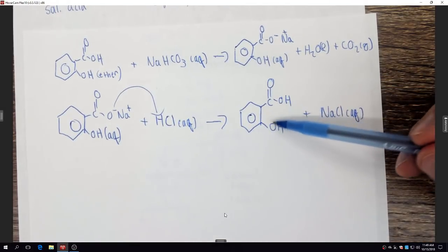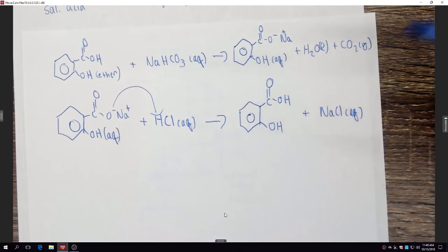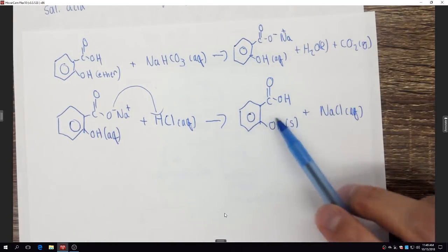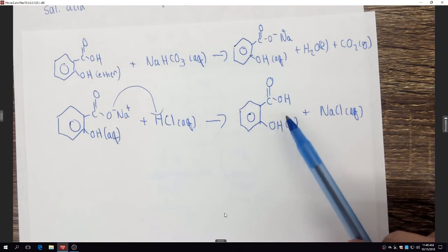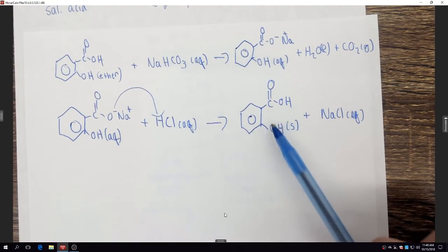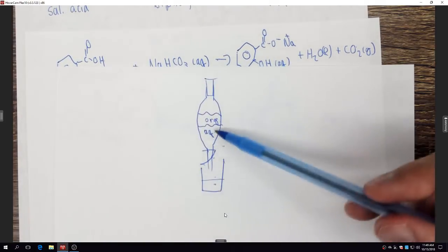What happens to this as far as a state of matter that helps us to isolate this compound? It's a solid. Why is this now a solid? Let's start with the first question. Why isn't it dissolved in ether? This will definitely dissolve in ether. Remember, we dissolved it in ether a little while ago. Why doesn't it dissolve in ether?